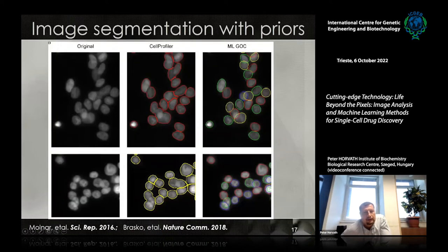The first one is when cells are sitting on the top of each other, and we would like to get them analyzed single-cell based and very accurately detected. If you see the left side of my screen, you see a couple of cases where cells are on the top of each other. But if you look at it closely, you will realize that there is an interesting property: cells that are sitting on the top of each other are somewhat brighter. This is not a big magic.